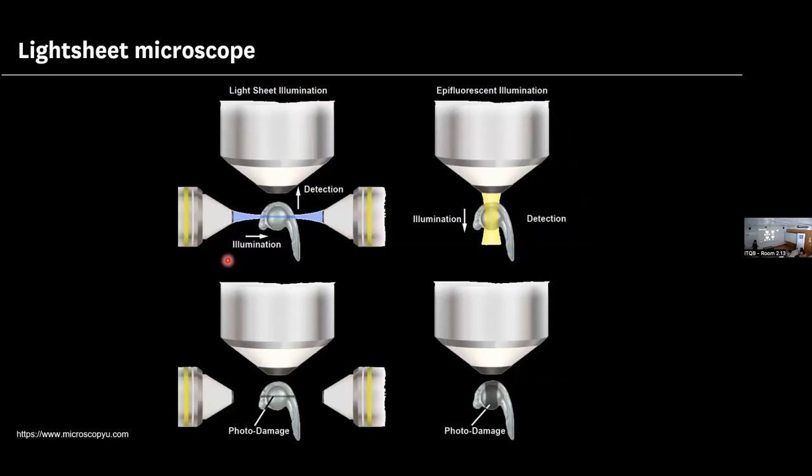Are you illuminating the sample from two sides or only from one side? You can do it from one side or from two sides. In this case, it's two sides. We have a light sheet at the IMM that uses two sides. You have also some light sheets that only illuminate from one side. From one side, doesn't the sample get illuminated differently? Yes, of course. It will. And it will also create some shadows, which you'll see. So traditionally and historically, the sample can be rotated so that you illuminate it evenly, or you can use illumination from both sides. So matching two planes of light in the sample, you can adjust the parameter so that they are uniform in that you don't have this difference. You still have absorption and scattering.